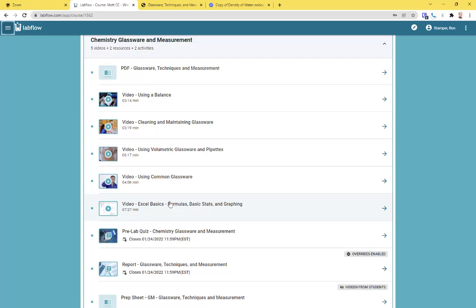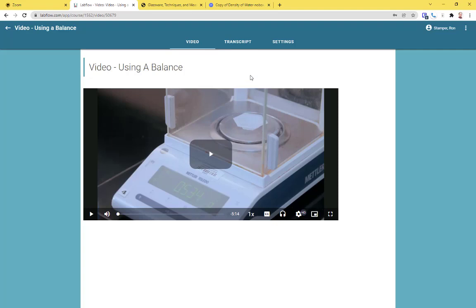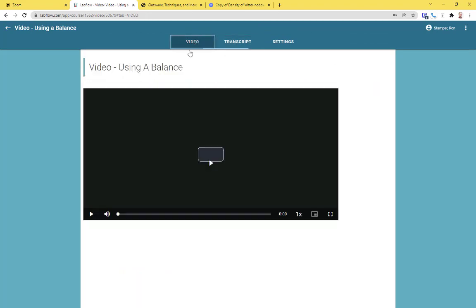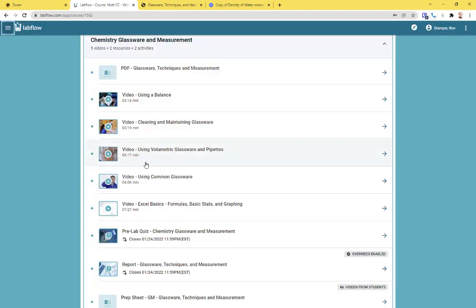Some of them may be repeat videos that are just kind of reminders, but you'll see they're all relatively short. They're all closed captioned and they have transcripts and everything else. So, if you want to look at the video, that's great. If you want to read through the transcript, you can do that. However you want to do that is fine. But all of the information you need for the quizzes and for the reports are contained in here.